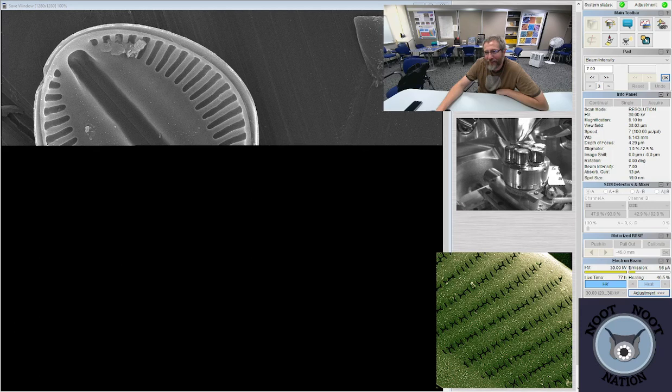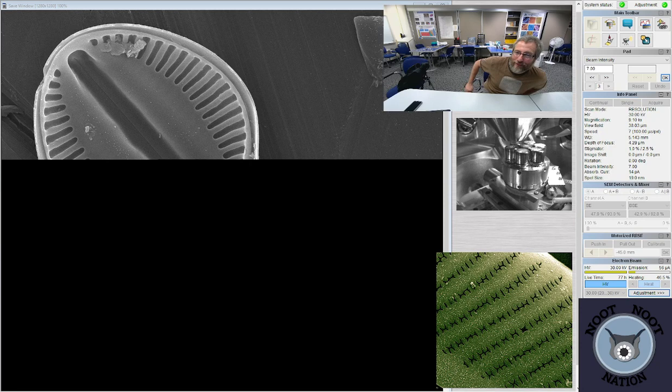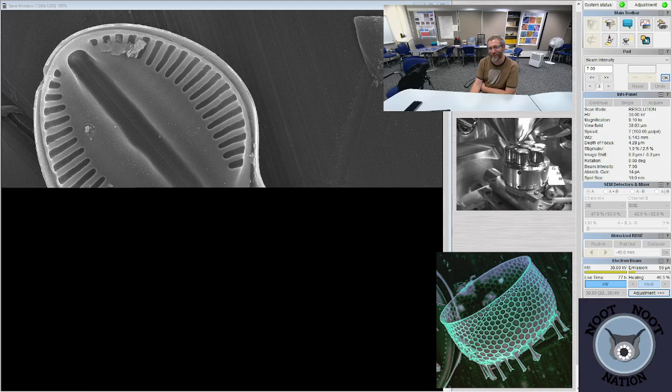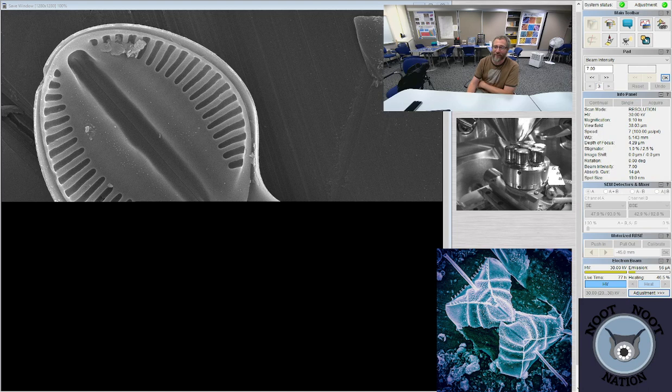Well, what does the stigma do? I have no idea, actually. I have no idea what the stigma does. Some of the diatoms have many, most of them have none. Looks like my phone speaker. Oh, that stigma, yeah, a little bit. You can also take pictures of your phone speaker and send those, and I'll try to identify it to genus.